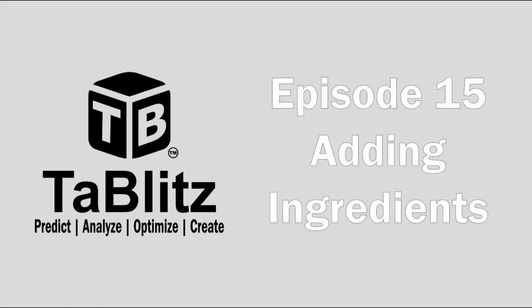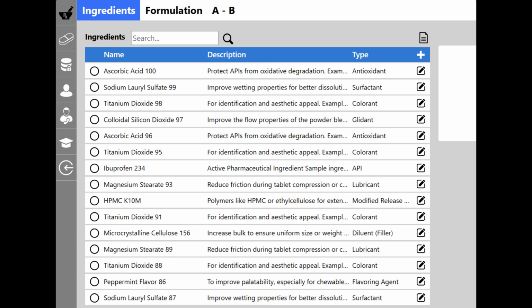Welcome to TaBlitz. Today, we'll walk you through the first step of creating a formulation in the formulation module, adding an ingredient. Here we are in the formulation module of TaBlitz.